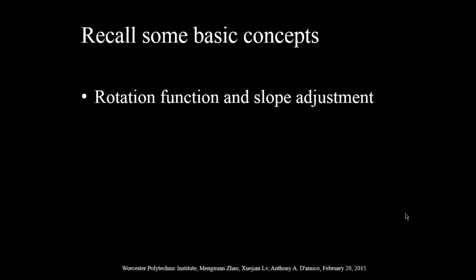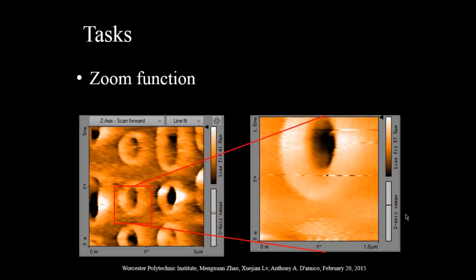In Instrument Lab 2, you also learned how to adjust the slope. Use the slope adjustment function to flatten your image this time as well. After you aligned the scan direction and adjusted the slope, you can start the image. Use the zoom function to select an image with a 1 micron scan range around the bit.